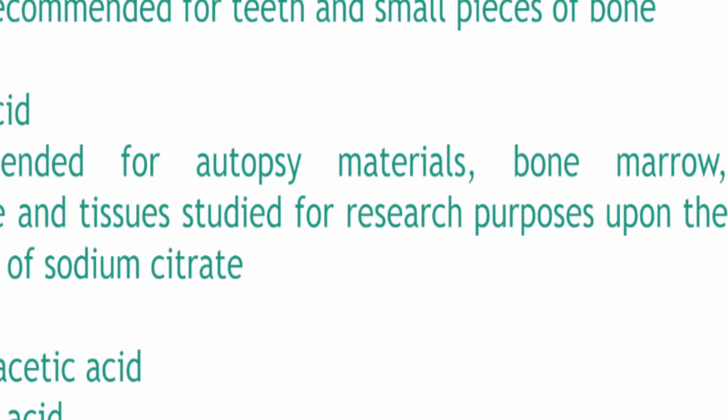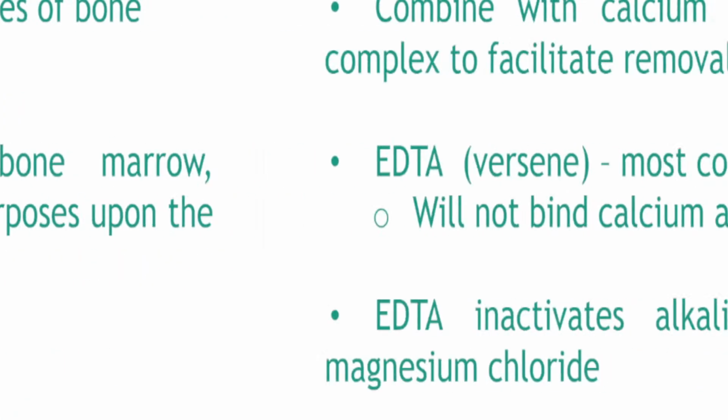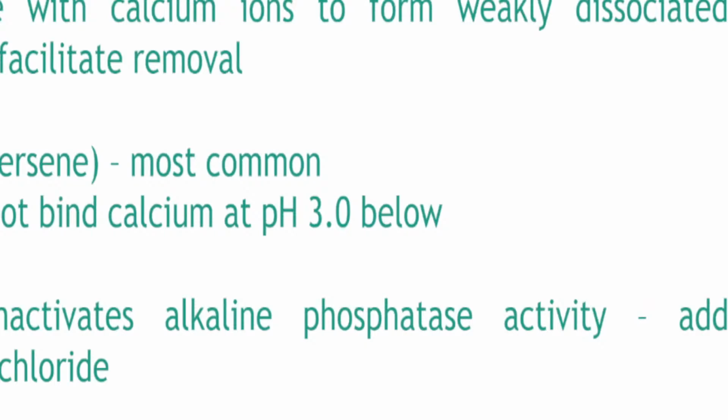Sometimes they will ask you that question, which of the following is a universal solution? When you hear the word universal solution, it is a fixative that has another function. Or it could be any type of reagent. You'll hear this over and over again when I discuss the chemicals that we're going to see later on in the discussion.